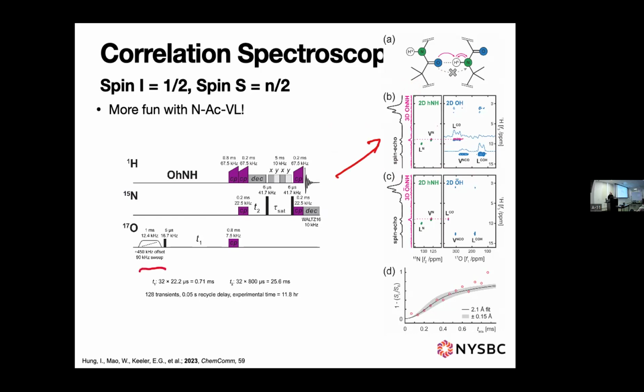So we're starting with our first pulse on oxygen. Then we're digitizing the oxygen dimension, doing a CP up to the proton, and then straight back down to nitrogen, digitizing the nitrogen dimension, water suppression, CP back, detect. And we get the spectrum that's here, the spectrum in pink.